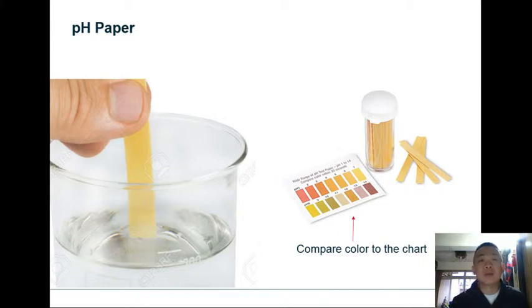Now the main advantage of this method is it's very easy to do, very convenient. You just stick a paper into the solution, boom, and you already have a result. The main drawback of this method is it's not so accurate.